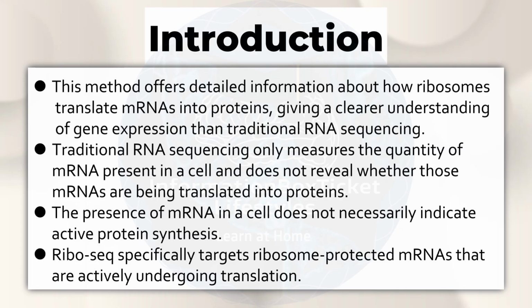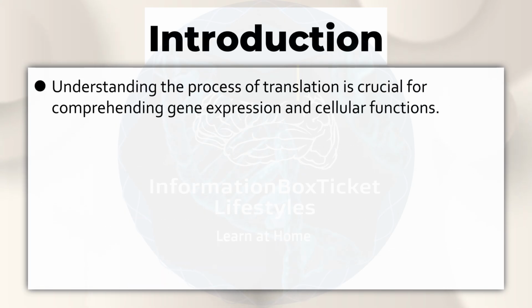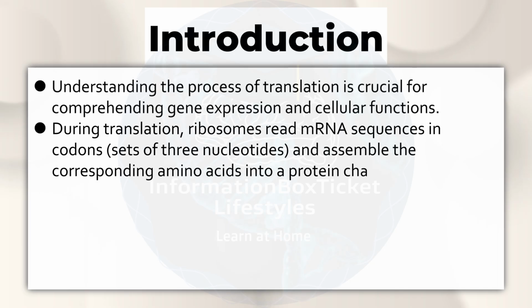Ribo-Seq specifically targets ribosome-protected mRNAs that are actively undergoing translation. Understanding the process of translation is crucial for comprehending gene expression and cellular functions. During translation, ribosomes read mRNA sequences in codons, sets of 3 nucleotides, and assemble the corresponding amino acids into a protein chain.